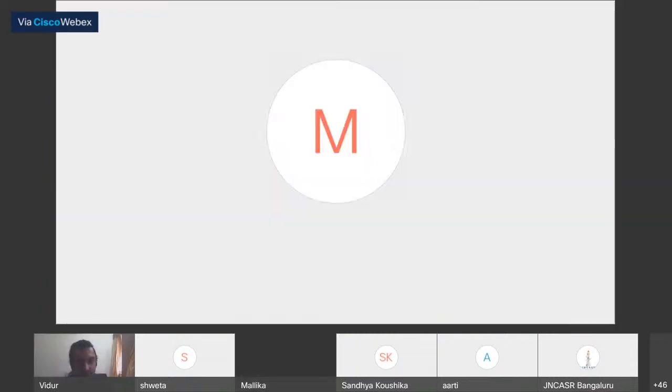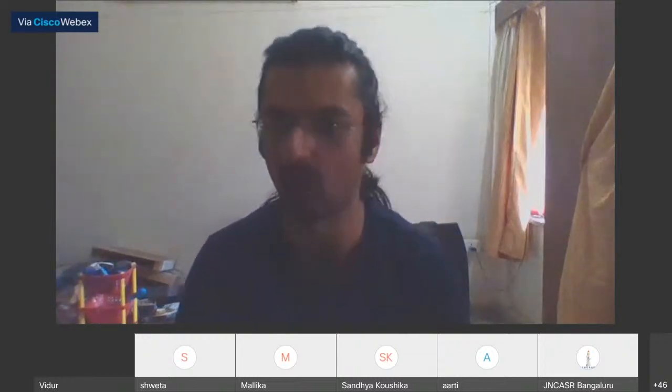Yeah, sure. Okay. So I am going to share my screen. Everyone, please open Fiji and some spreadsheet manager like Excel or Google Sheets. Anything will do.